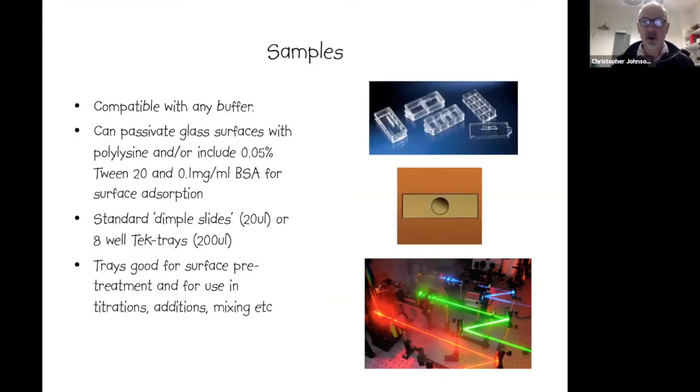In terms of samples and how we put our systems of interest onto the instrument, this kind of confocal setup is compatible with pretty well any buffer at all. In terms of surface adsorption problems, we can passivate the glass surfaces.